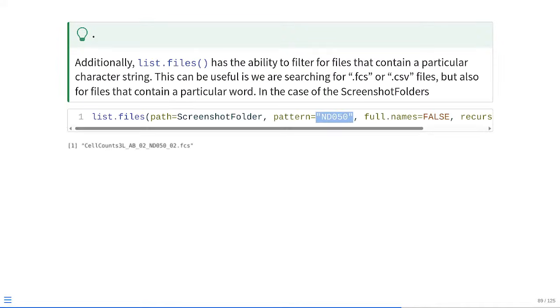So you'll also notice in this case it only returned a value of 1, even though in that original vector we had back, it was a second location for the ND50 specimen. Listing of files is kind of dynamic. It only will index based on what is actively returned. So in this case, it's returning as the first object, with the first value within the actual object we're creating.